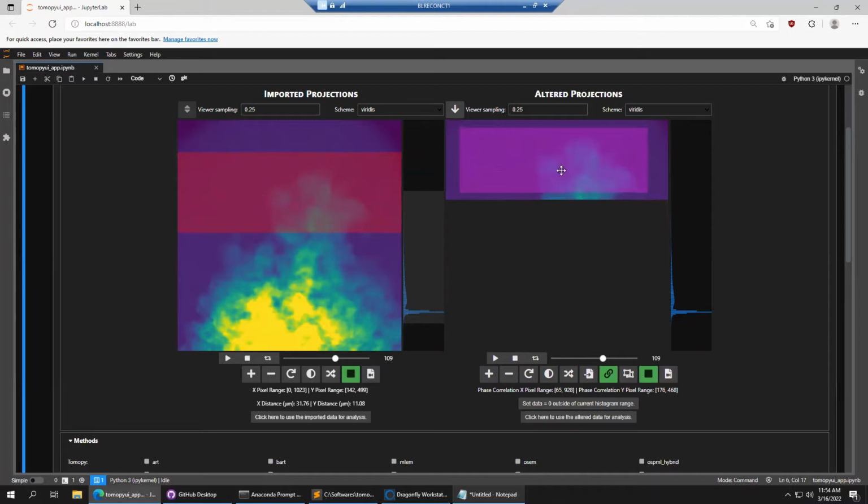So what we're going to do here is set a region to compare to. So if I wanted just to compare this part of my data set to the reprojected images, that's what it would do. Okay, so I'm just going to make this relatively large.